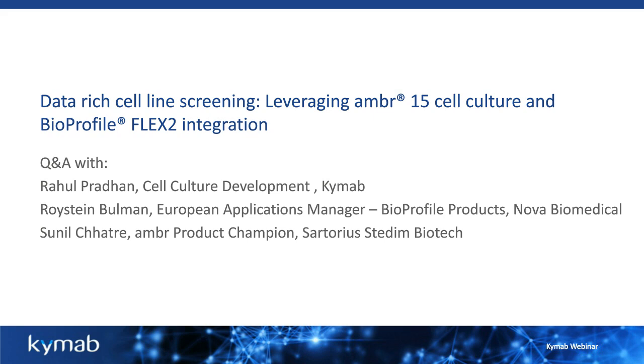And now that we're talking about feedback loops, I'd like to include Sunil, who is the product champion for the ambr system. Could you give an overview on how the feedback loops could work with the equations and the variables? Yes, so within the ambr15 we have an equation editor that allows you to develop fairly complicated equations as per your requirements. So you can include properties such as specific growth rate, glucose consumption rate, or consumption rate of any particular metabolite that you want to control.